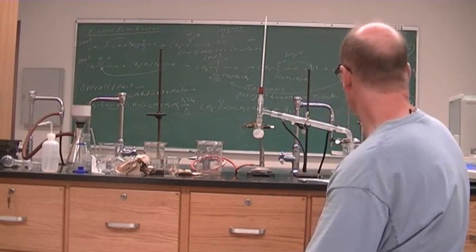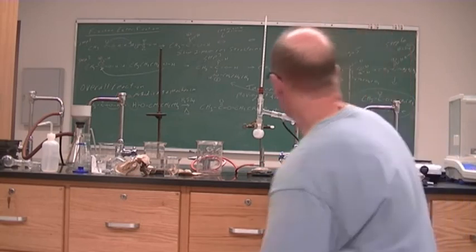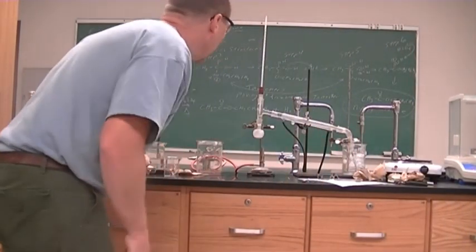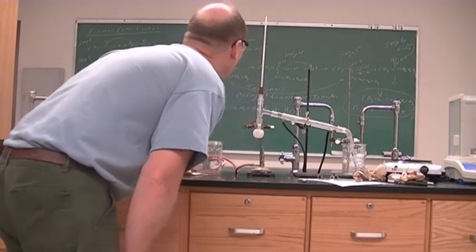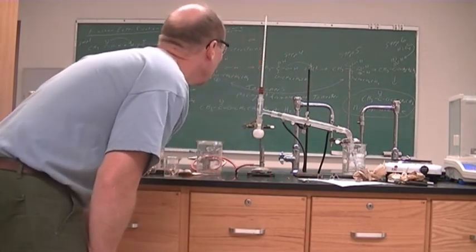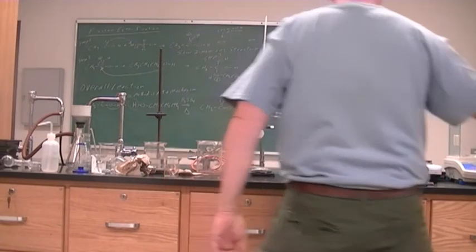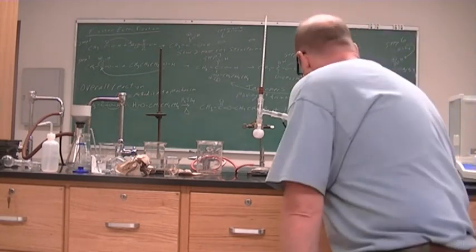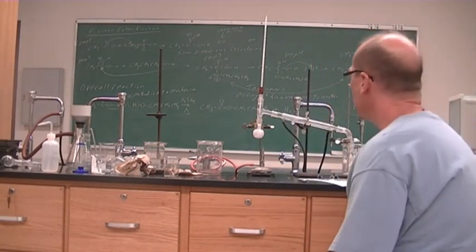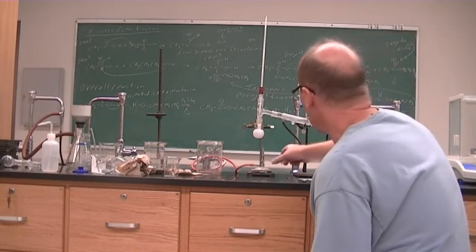Over pretty nicely. All right, we may have to redistill it. We're at 102 degrees Celsius now. All right, it says to collect it between 80 and 115. Yeah, we don't want the white going up that high.